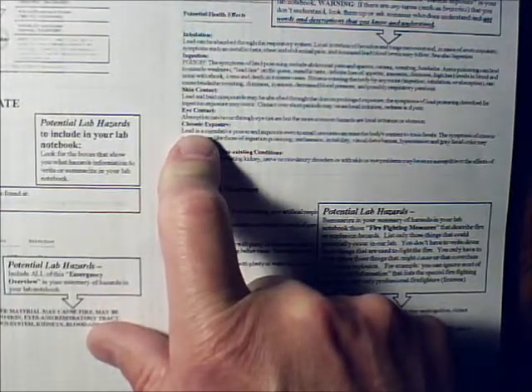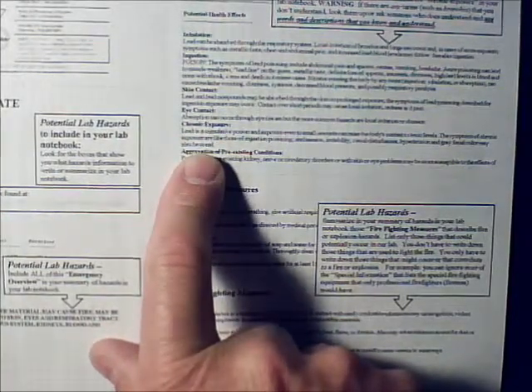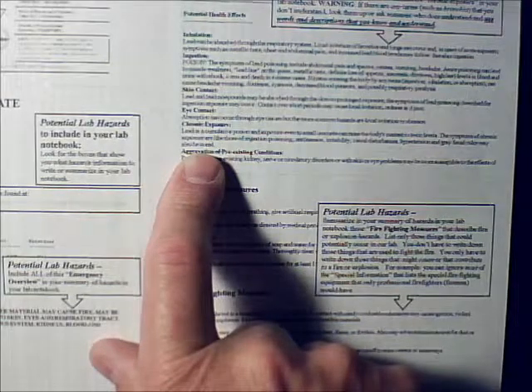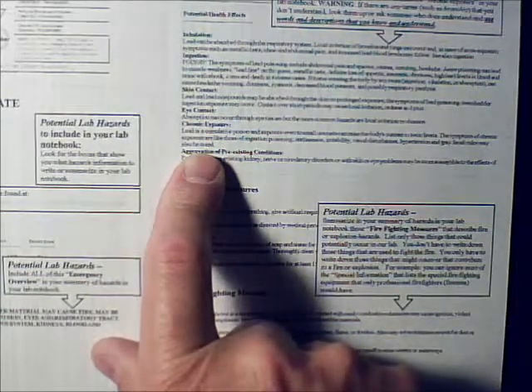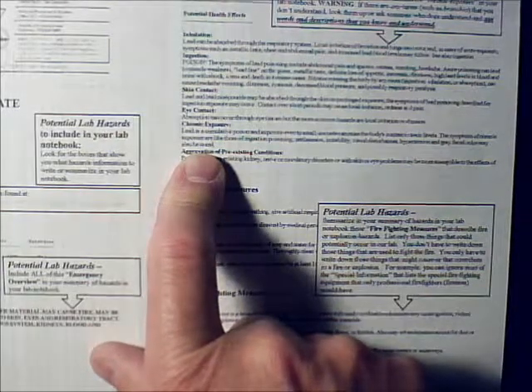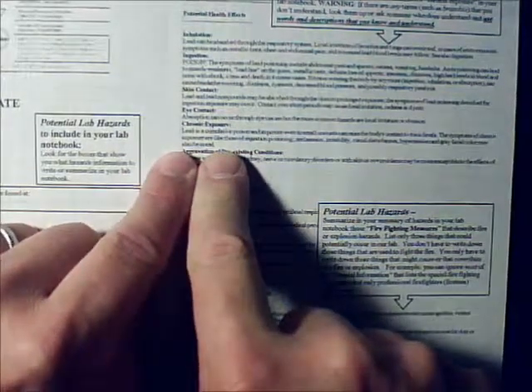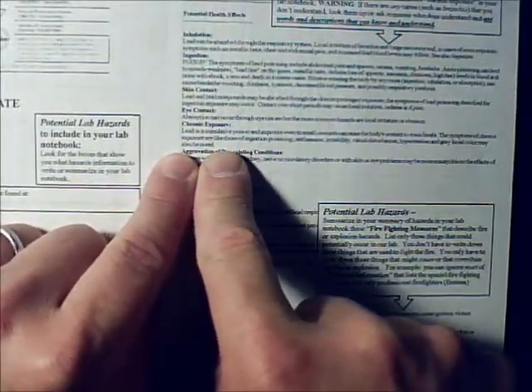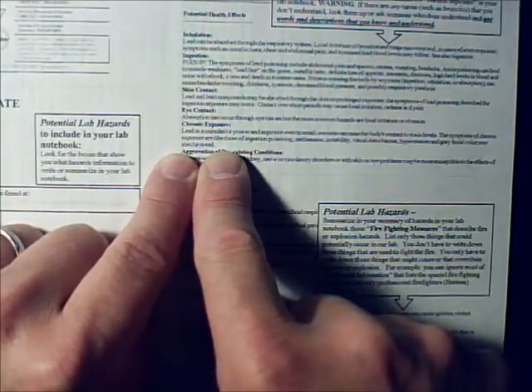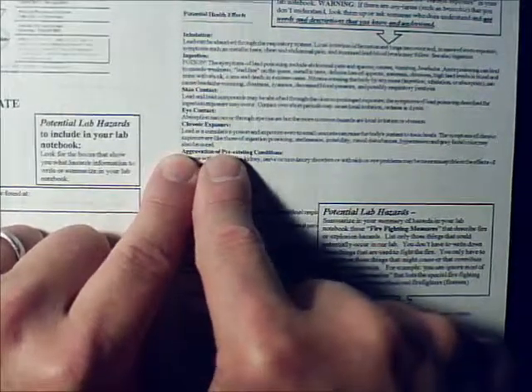Overtime. If you are continually exposed to it, these are possible dangers. Is that going to happen to you in one lab? No. It's not going to happen. That's a thing that happens when you're exposed to it over and over again. Do you need to have it in your lab notebook if it's chronic here? No, because it's not going to happen in the lab.